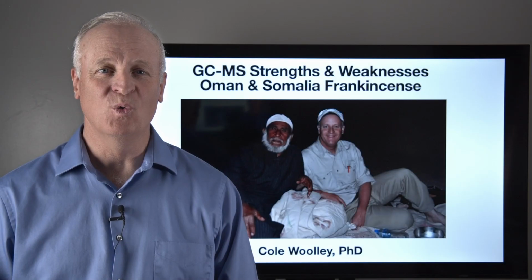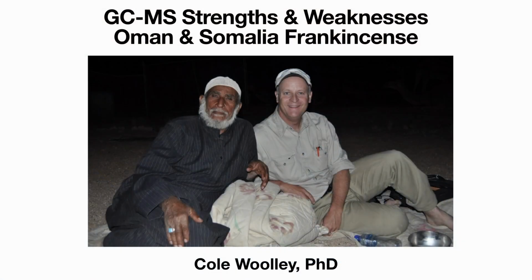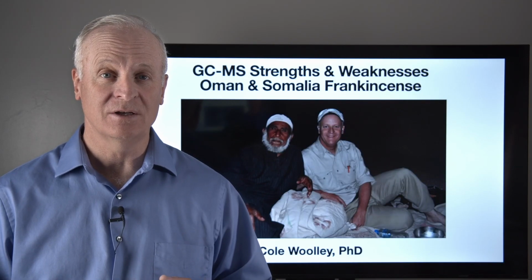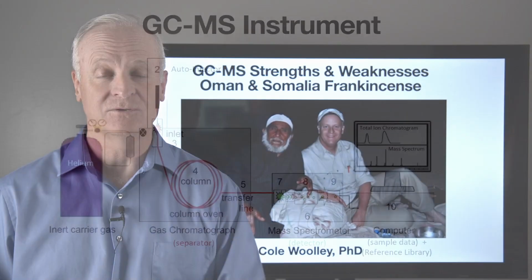Hello, this is Dr. Cole Woolley, and this lesson is called GCMS, Strengths and Weaknesses. This is all about how the GCMS can help me separate and differentiate Oman frankincense from Somalia frankincense. And this is the story.